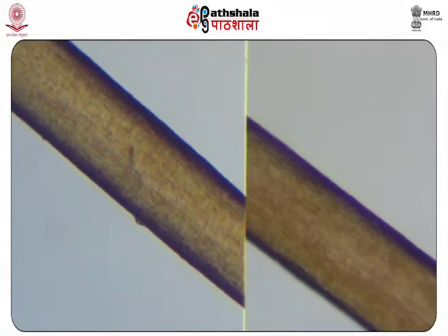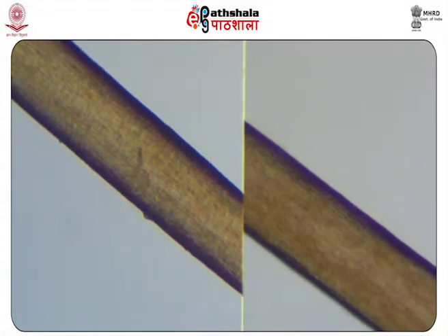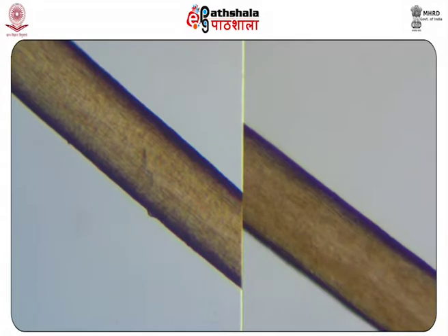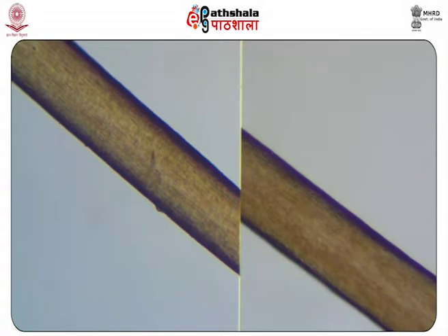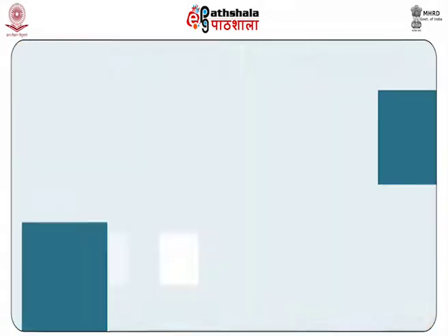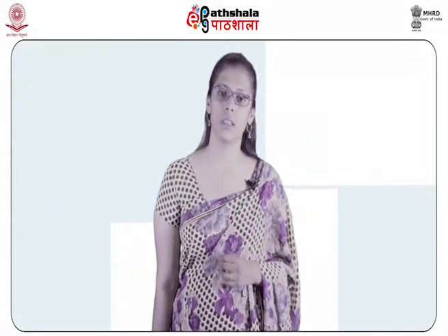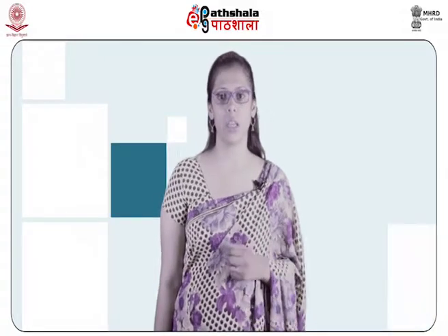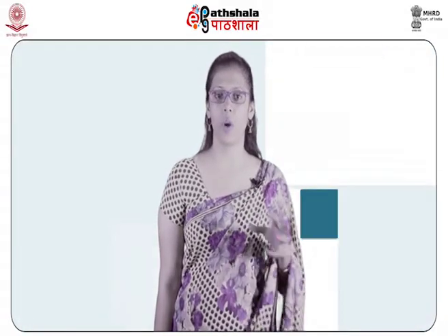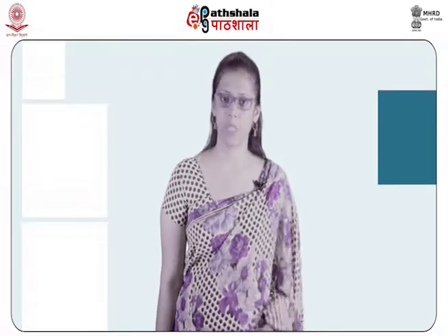The importance of hair evidence is associated with the variability of hair features among persons in the population, which can be visualized by the use of comparison microscopy. There are several factors that influence the dependability of a hair examination, including experience, training, appropriateness of recognized hair standards and adequacy of equipment.